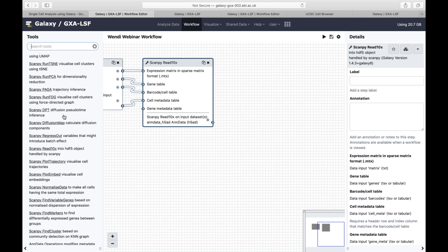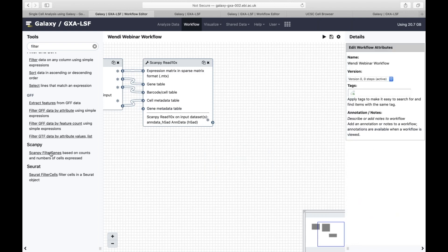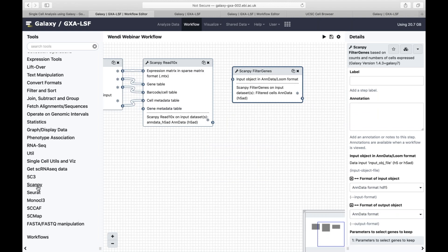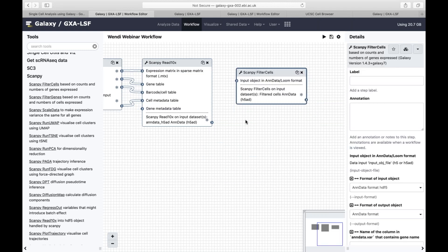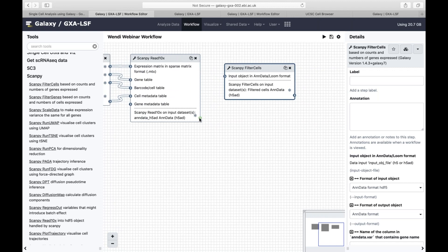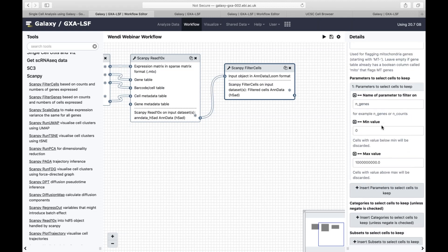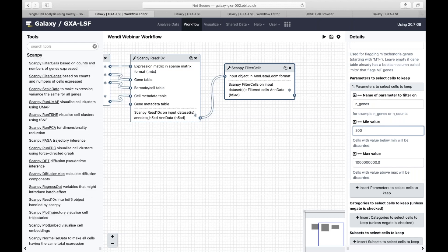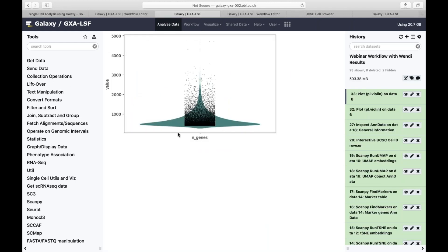If you know scAMPi is getting long, you can search the toolbox — for example, typing 'filter cells' will show the scAMPi filter cells tool. There's a lot of background in single cell data, so you have to filter out the background from your cells. I can connect these tools and then set my filter — in this case it's the number of genes. How many genes make a cell? Do I need 300 or 500 genes? There are a number of plotting functions you can use to help justify those decisions, like scatter plots or violin plots.